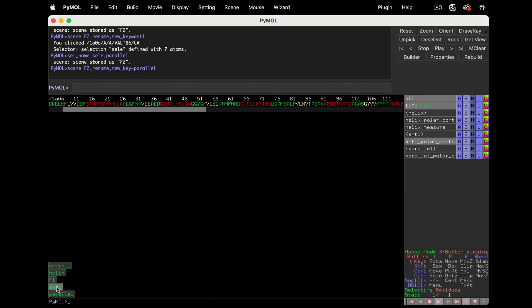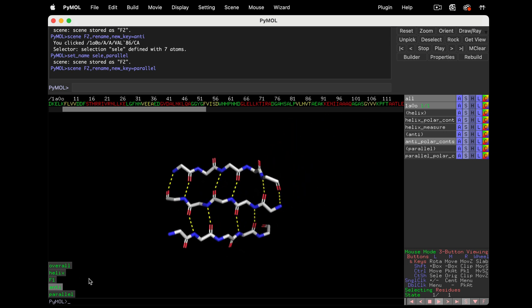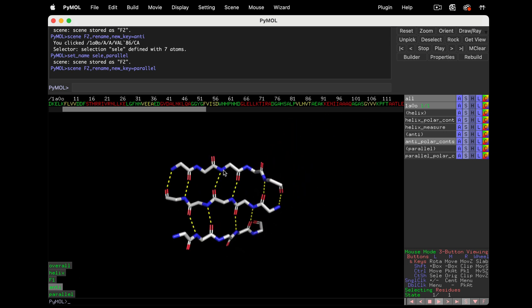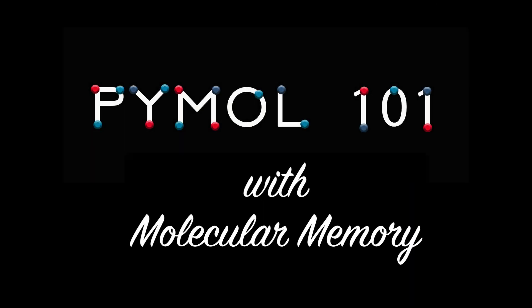Return to the anti-parallel scene now and repeat this analysis. On this strand that's positioned near the top, the nitrogen is to the right of the carbonyl. On the next strand, here's a carbonyl, and the adjacent nitrogen is on the left. The strands run in opposite directions in this anti-parallel beta sheet. And that's our lesson on measurement and secondary structure. I hope you learned something.